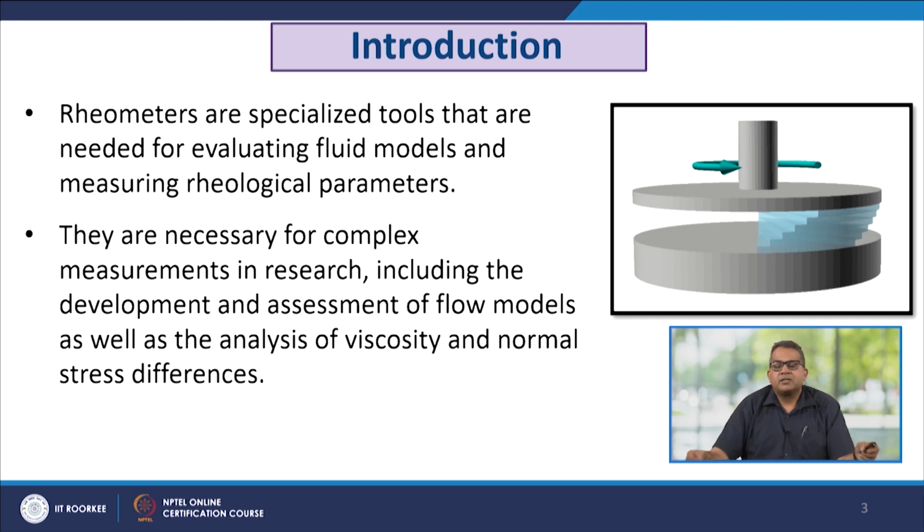Now, rheometers are usually specialized tools or mechanisms that are needed for evaluating fluid models and measuring rheological parameters.